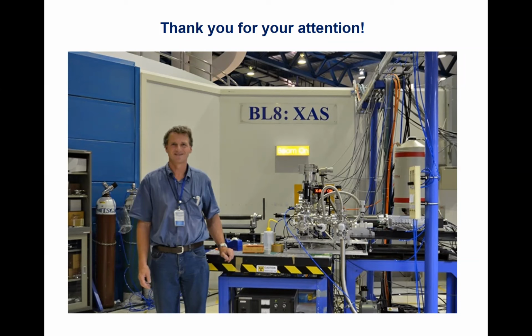But maybe it's really worthwhile to invest more brain for me as a soil scientist. So these calculation issues, so FEFFIT and other things, they are more easily doable for physicists who are trained on that than for soil scientists. But maybe we should invest more time and brain dealing with these programs and apply them. You're completely right. I'm just somewhat deterred of that. Yeah, so I'm coming from a different profession. That's so integral equations, I don't like too much. Yeah, and the other issue, it was your puzzle and the solution to apply EXAFS, which in principle would really be very, very nice to do.